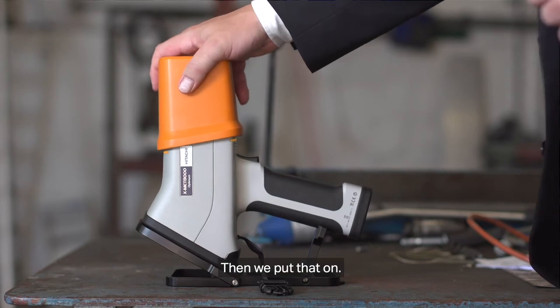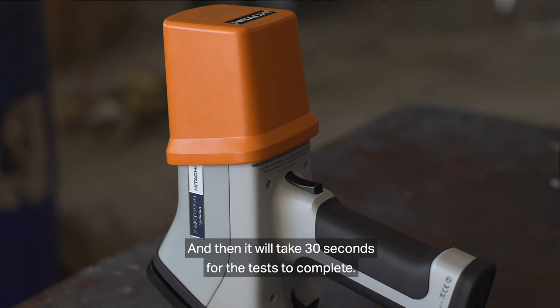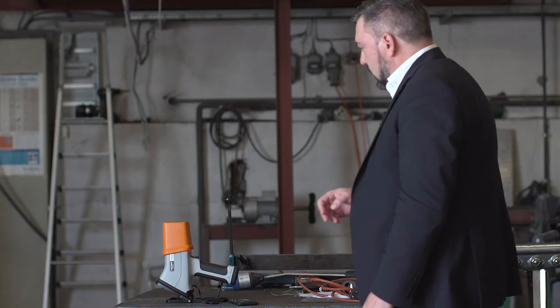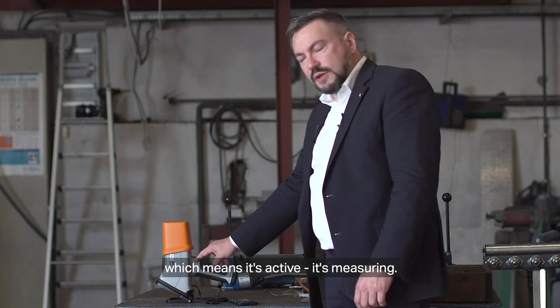Then we put that on and press the button. It will take 30 seconds for the test to complete. As you can see, it's blinking red, which means it's active — it's measuring.